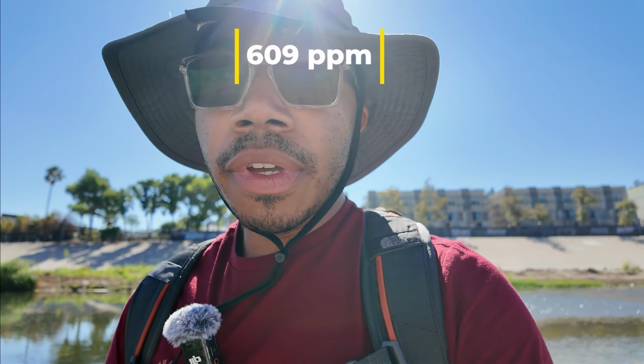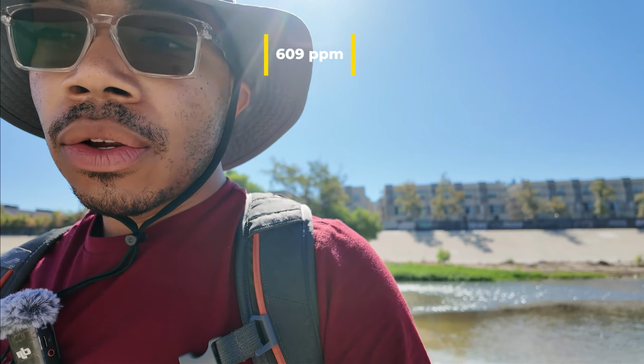So the slower moving, shallower side of the river reached up to 600 parts per million and would be considered more contaminated. So beyond the visible contamination we've seen in previous videos from the larger sources of litter, we are seeing signs that there are smaller contaminants that are also impacting the quality of the water. Notably, I probably should have worn some sort of bug spray, as I could tell there are quite a few mosquitoes over here, but science takes you places.